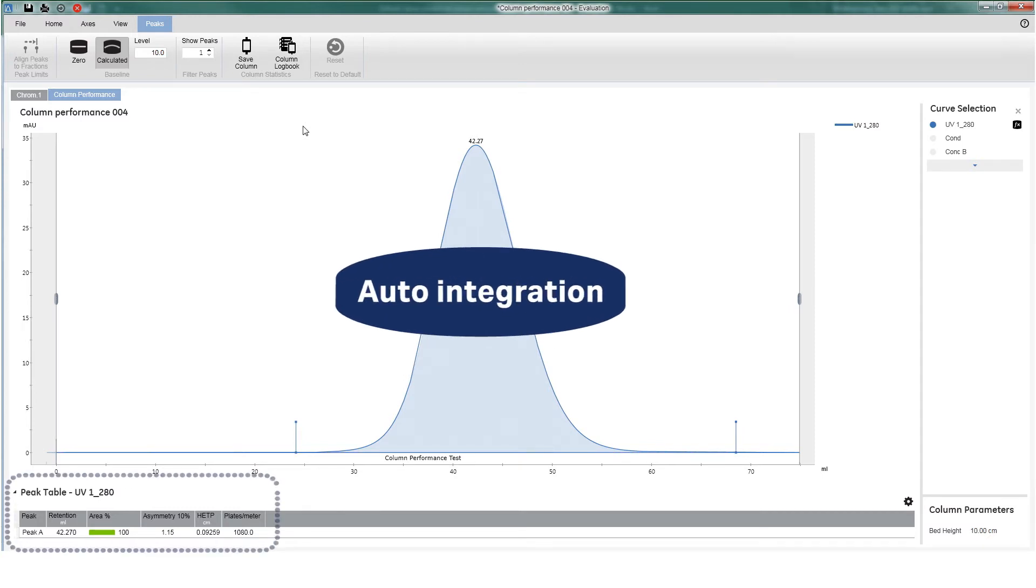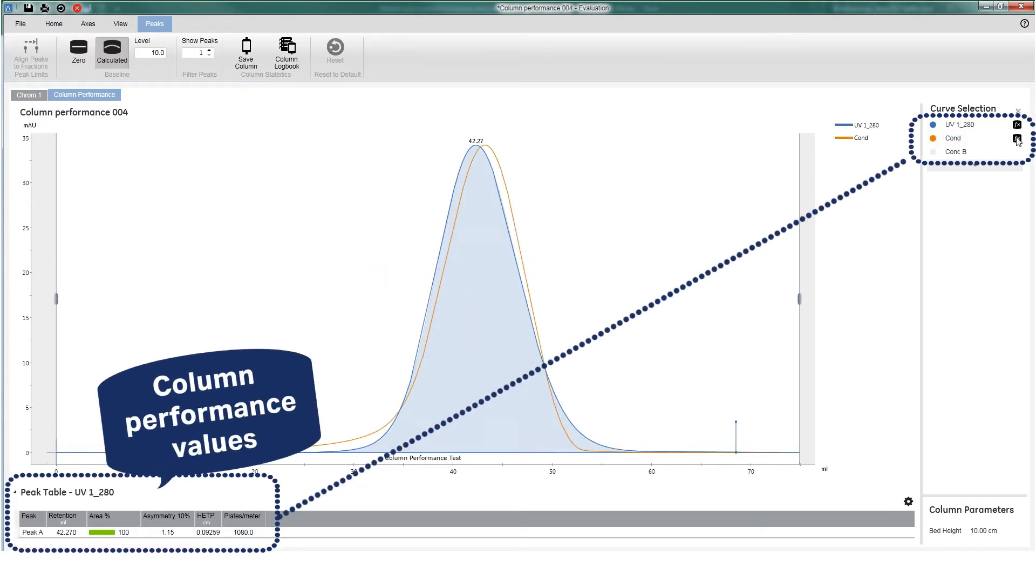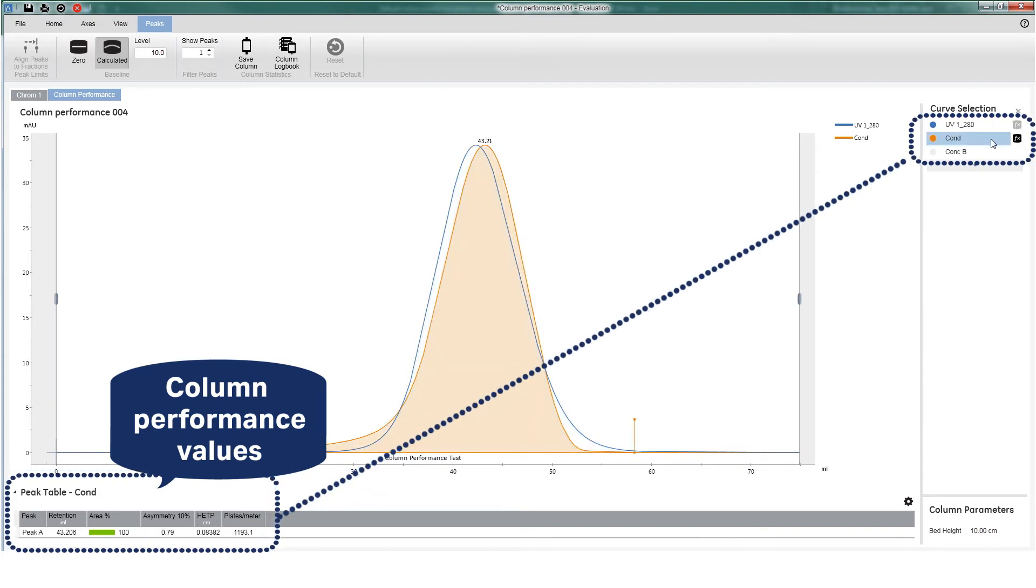Important performance values are presented in the peak table. If a salt pulse is used to test column performance, select the conductivity curve to evaluate the result.